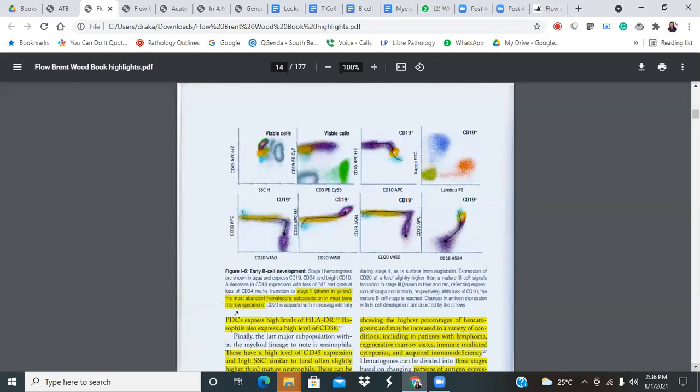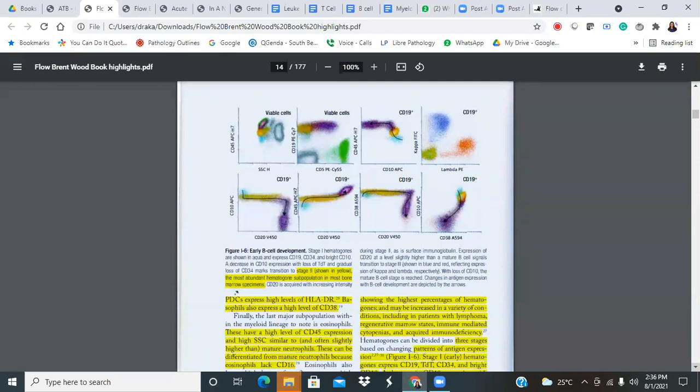Akanksha, I know it would definitely come up later in the sessions, but I think hematogones could be confused with the B-ALL cells. That's why they are important. Is there any particular marker that helps, or is it the pattern that helps the most? Yeah, to me, the pattern helps most. The hematogones will have that variable expression of CD10, CD20, and so forth. And also they look different in terms of morphology. At the same time, the B-ALL will be a big blob sitting there, and it will not have that particular maturation pattern.